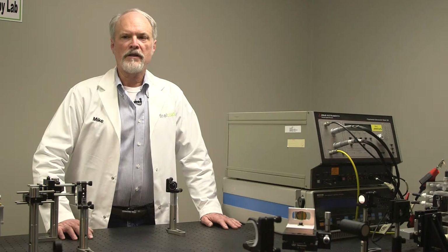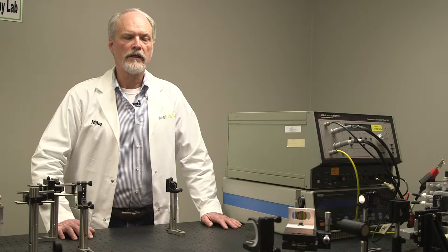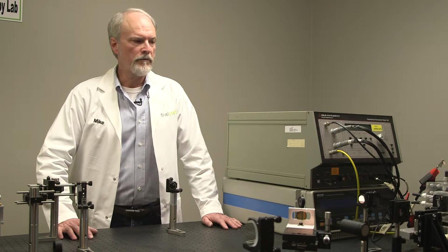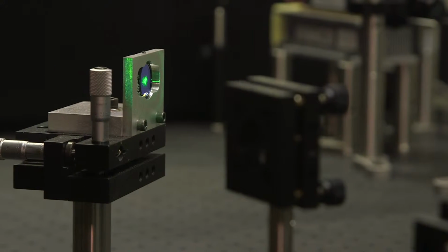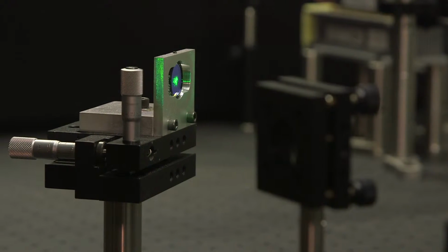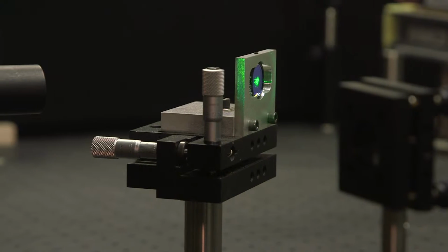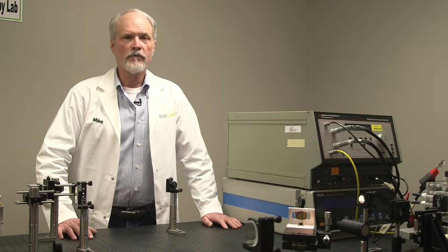We're now in the Raman spectroscopy laboratory. This is rather unique for a corrosion lab. However, they do appear in some well-equipped laboratories. The utility of the Raman corrosion process is it lets us study corrosion in situ. That means that we can study the corrosion products and what's happening on the surface while it's underwater.